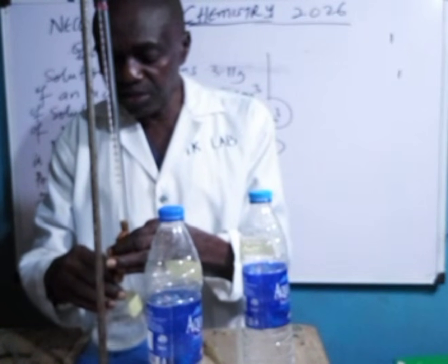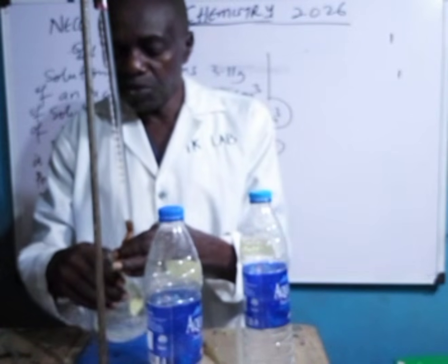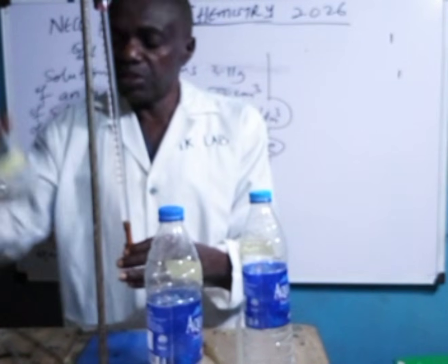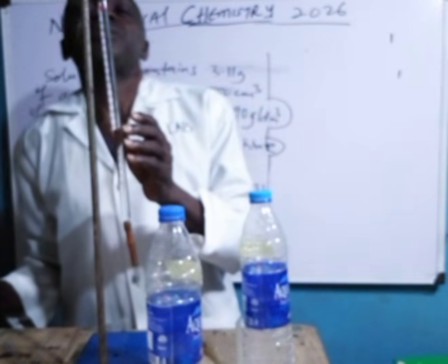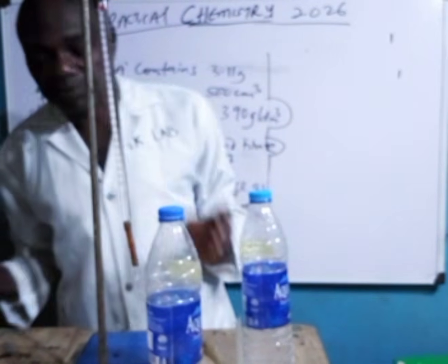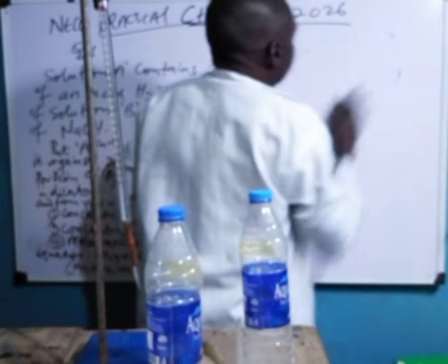Be stirring it, swirling it. Okay, it has changed. This is the color it has changed to. So it is orange. So let's check it. It's at 25.0 cm cube. So let's draw our table.